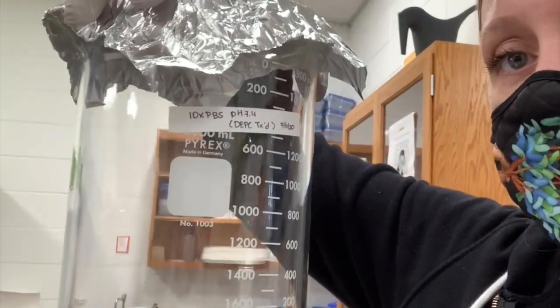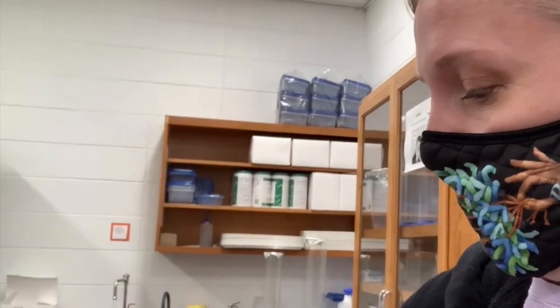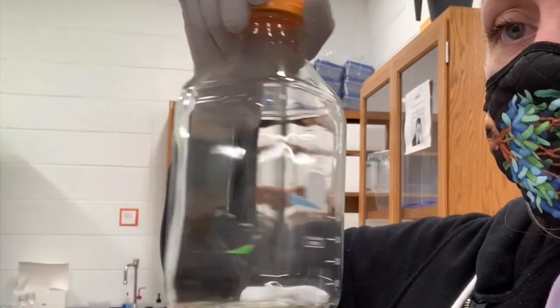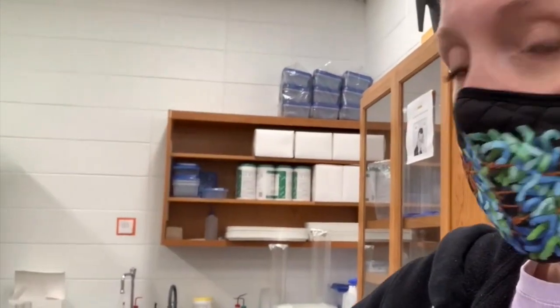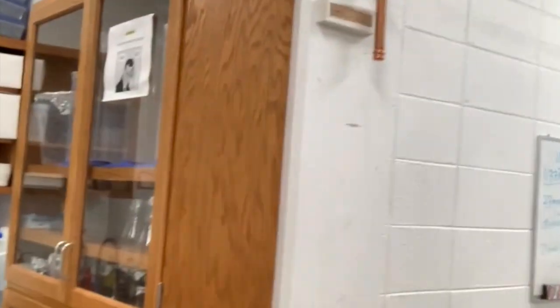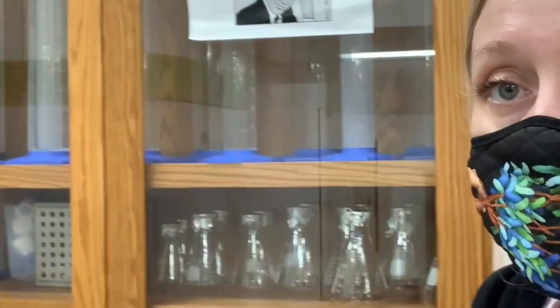So what we're going to do now is to make this 10x PBS solution, and I'm going to tell you that the first things we're going to need out of the glassware cabinet are a beaker. So we're going to make our solutions when they are bigger than 50 milliliters in a beaker. And we're also going to need a bottle. This is where we will put the solution after we've made it. And finally, the last thing we'll need out of the glassware cabinet, which is over here, will be a graduated cylinder. There are some of those at the top, and I'll come and get that when we're ready for it. So the first thing we're going to do is set up for the solution and add these components to get this mixing.